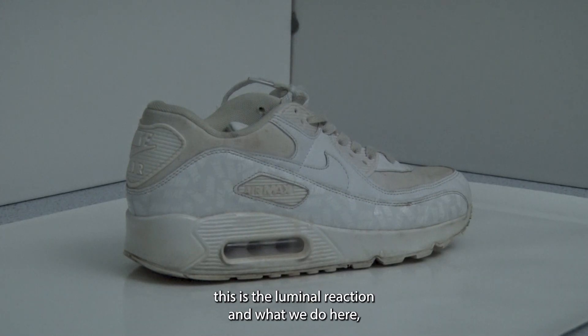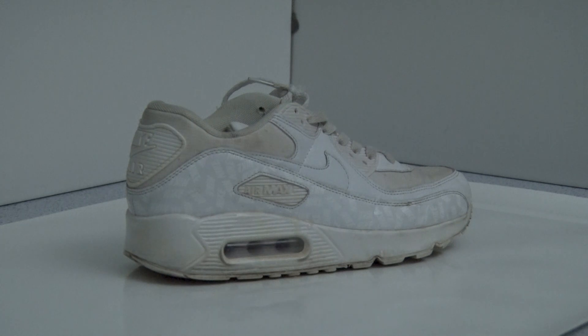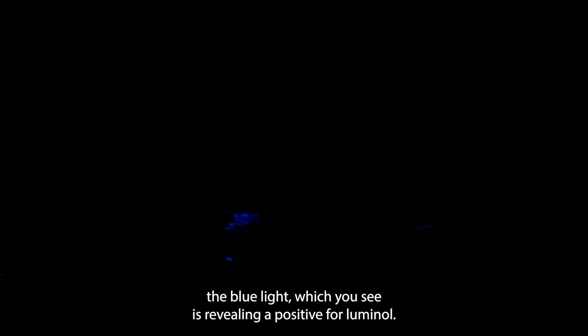For the luminol reaction, we first take a daylight shot so we know what we've sprayed luminol on. Then we kill the lights because luminol must be done in total darkness. Then we spray the reaction. As you can see, the blue light reveals a positive luminol reaction — in the toe cap and within the crevices of this trainer.